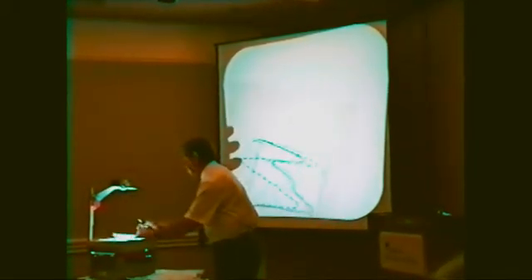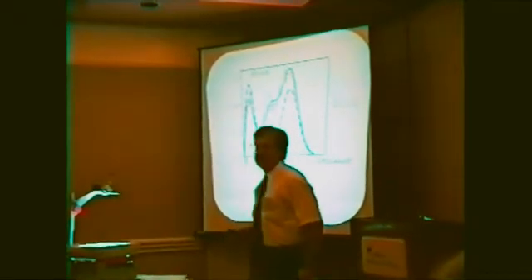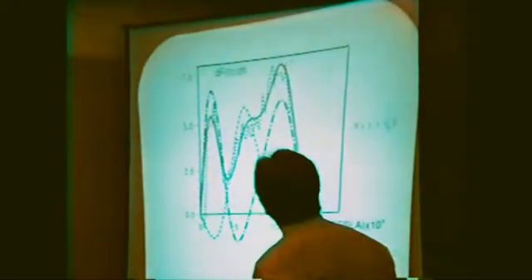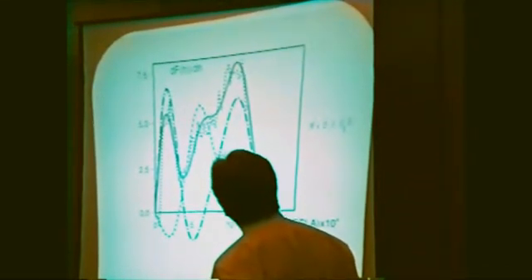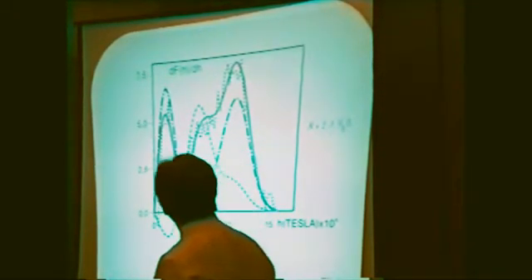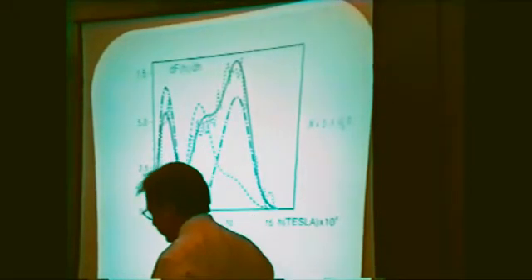Of course, if you increase the water concentration, you see that you change very much the shape of the signal, and in that case, you have in dark blue hydroxonium ion, and in light blue the residual concentration of free water, and you see that we no longer have the signal of the OH group. That's normal because all are engaged in the formation of hydroxonium.